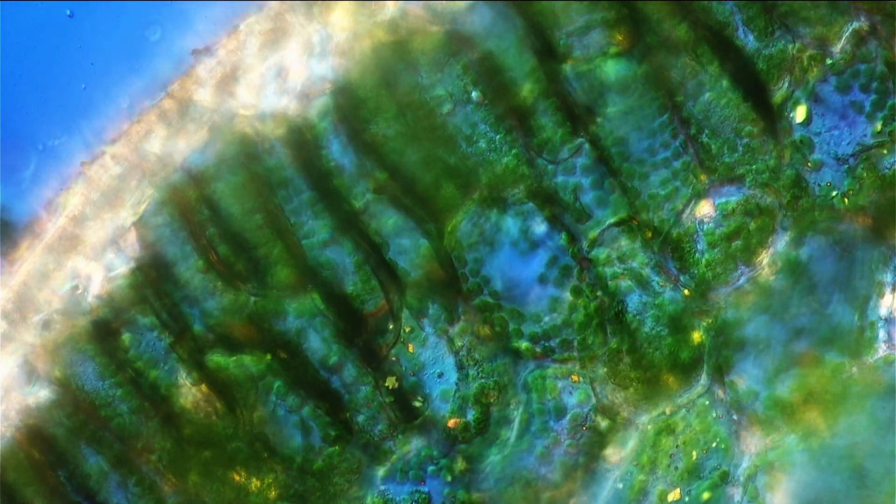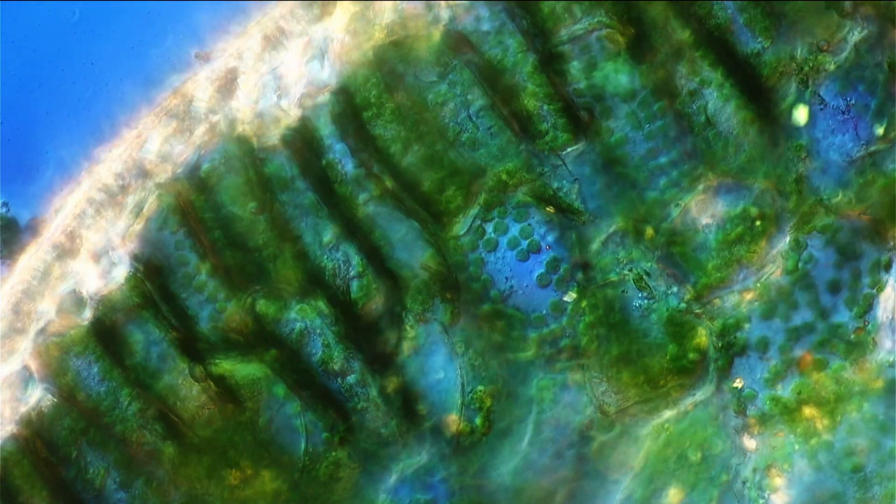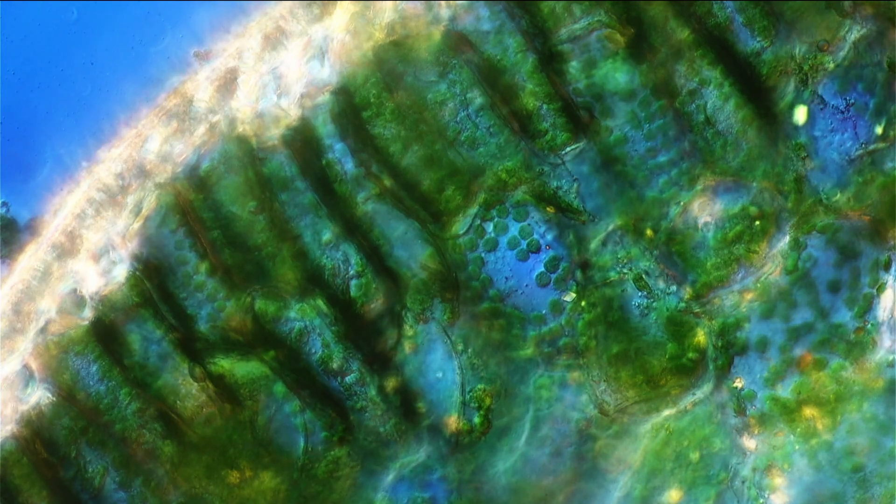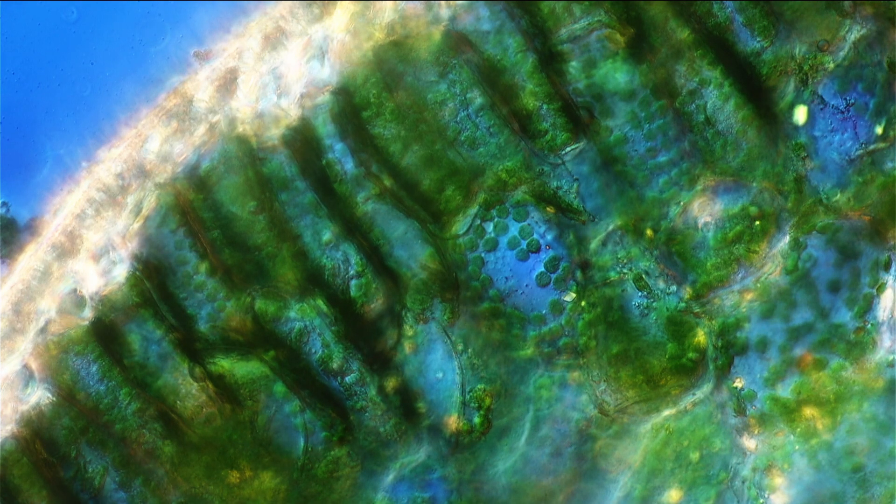Of course these are the green cell organelles that are responsible for photosynthesis. So even that worked out, so I was quite happy with the result. And I looked around and I found one cell that I decided to use as, so to say, the standard cell for all further calculations.